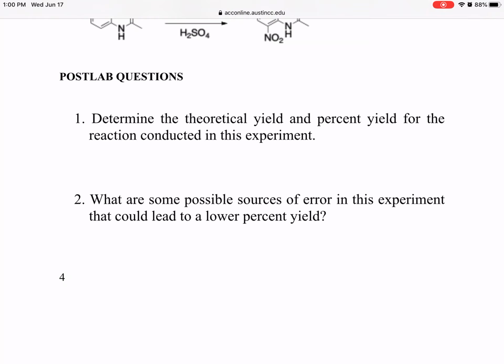So we also need to control how the reactants mix together to form the products, and also we need to change the thermodynamics, which is by heating the reaction mixture. You may be heating too low, you may be heating too high, so then the reaction can go wrong, right? So these are some of the human errors.